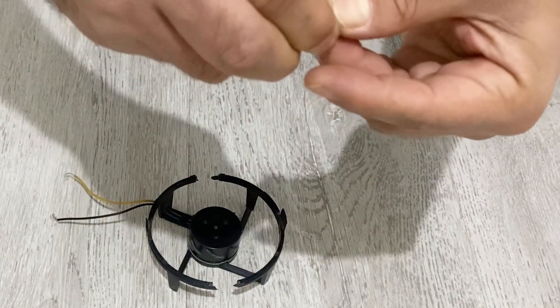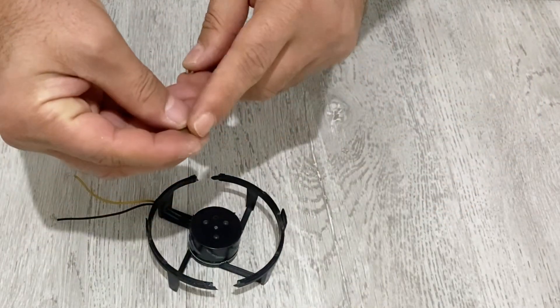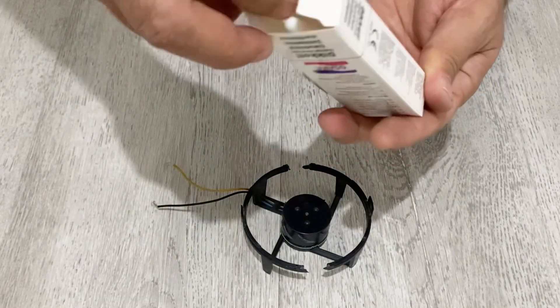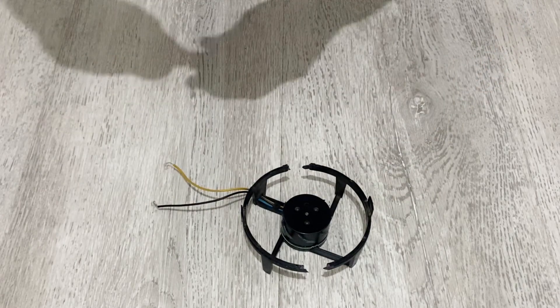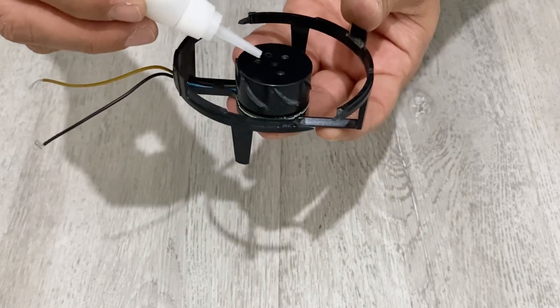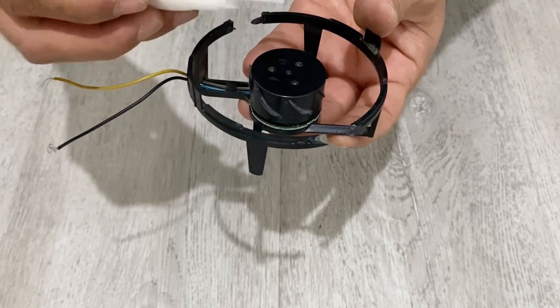Now I am going to use these pieces of neodymium magnets. I will stick these two neodymium magnets on here to make our magnetic stirrer. I'm going to use super glue — just one drop, not too much.